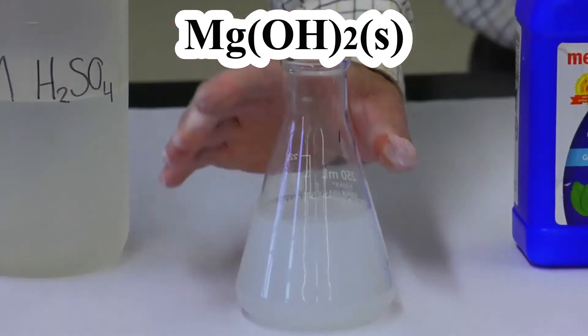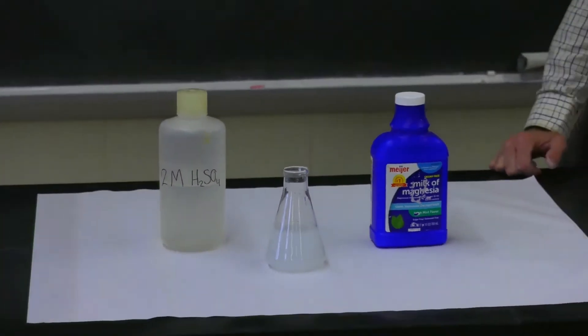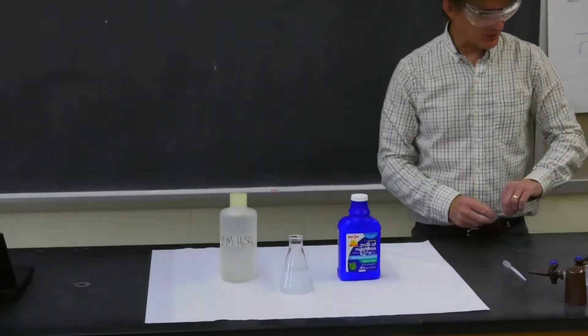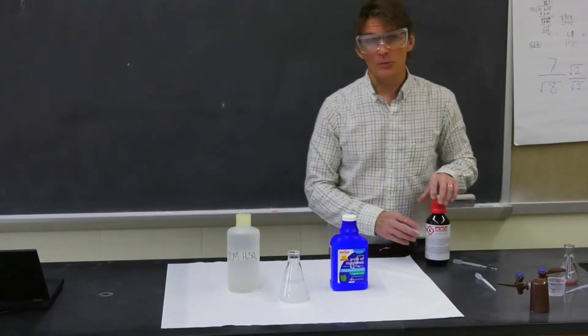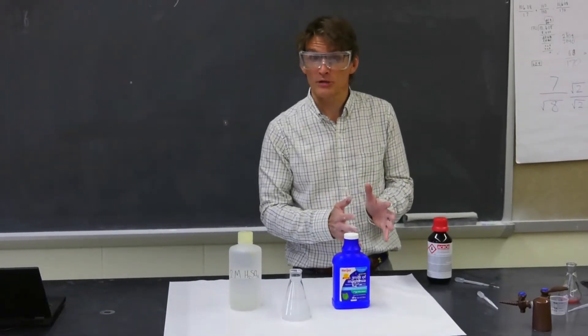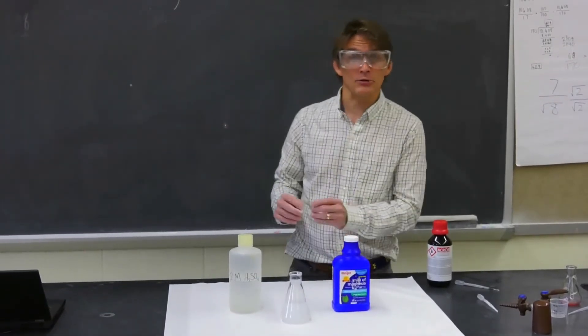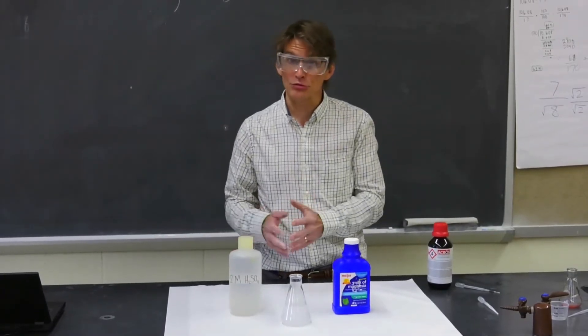Now what I'm going to add to this mixture is what we call an acid-base indicator. The particular acid-base indicator I'm going to add will be blue or violet — blue or purple — in a base. It will be red, orange, or yellow in an acid. If it's neutral, it will be green.